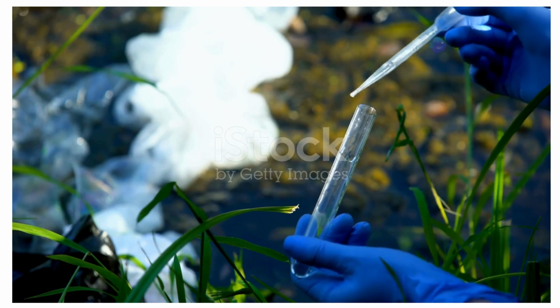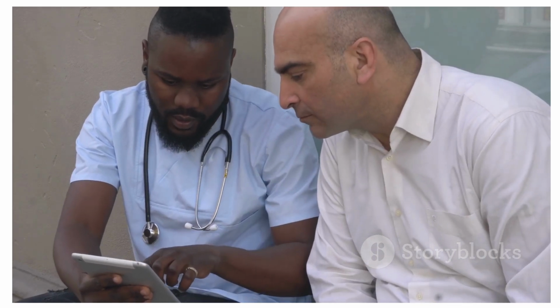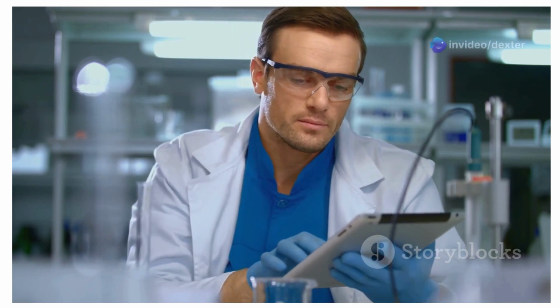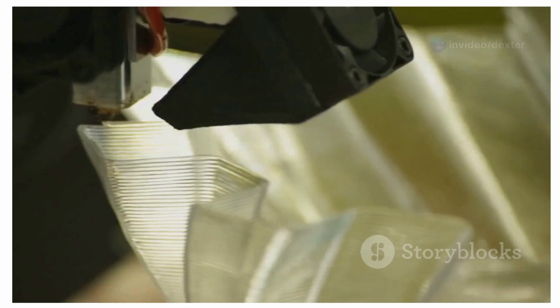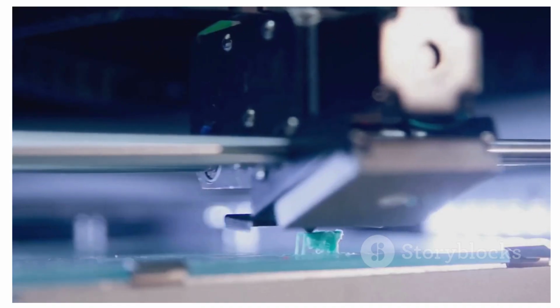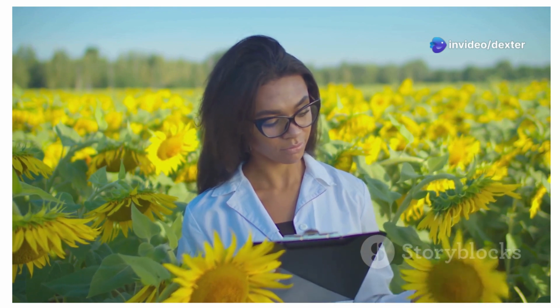The first step in bioprinting is to create a bioink. This ink is made of living cells and a gel-like material that provides nutrients. The cells can be from the patient, which reduces the risk of rejection. Scientists then use a three-dimensional model of the organ or tissue to guide the printer. The printer deposits the bioink layer by layer, just like a regular three-dimensional printer. These layers are very thin, often just a single cell thick. As more layers are added, they fuse together to form the desired shape. This process can take hours or even days, depending on the complexity of the structure.